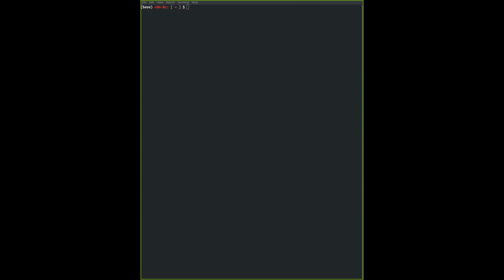Okay, generally I think everybody seems to be fine. Let me open up the participants as well, just to make sure. Okay, cool. We're going to start inputting and playing around with some of the commands in terminal. Don't worry if you can't catch up, and don't worry if you miss certain code. I will paste certain sections of the code into Etherpad so you can refer to it quickly if you miss out and lag behind. I will also show you a way to save the entire history of code that you have written today towards the end of the class.